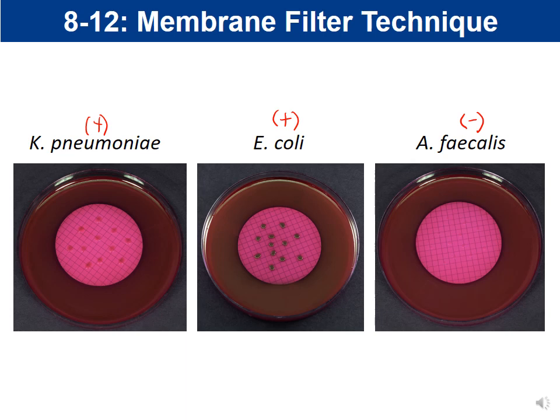However, you do need to answer those question sets, because that information about the MacConkey agar is going to be used for your unknown project. So you do need to review that. It does go with our coliform testing, so you want to answer those questions. But again, they're not on your practical. This question does relate to endo agar, so I'm going to address it here with you.